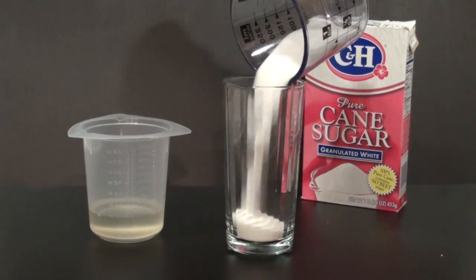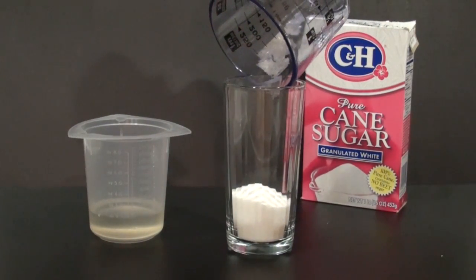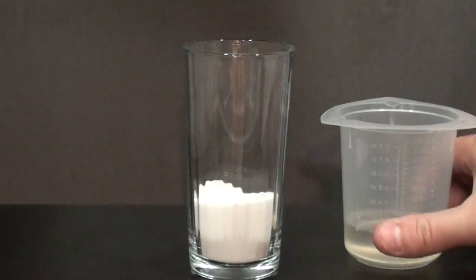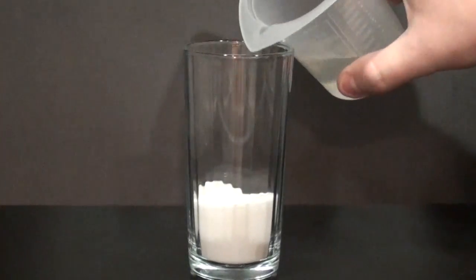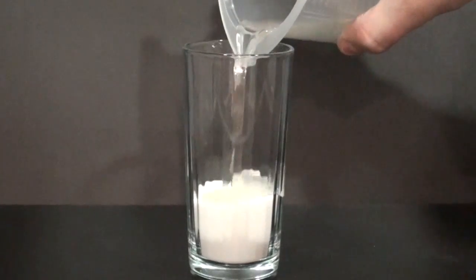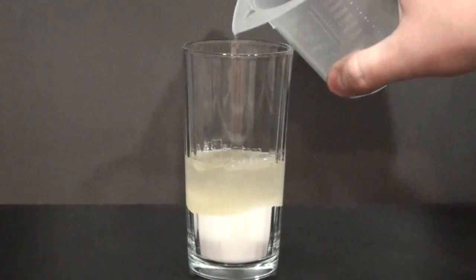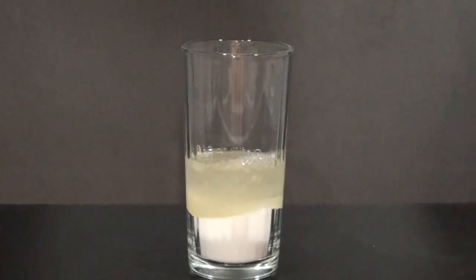Pour the sugar into a glass — that's the first step — and then we're going to pour in the sulfuric acid. If you get this stuff on your hands, you're in trouble, so really, you should stay away from it.